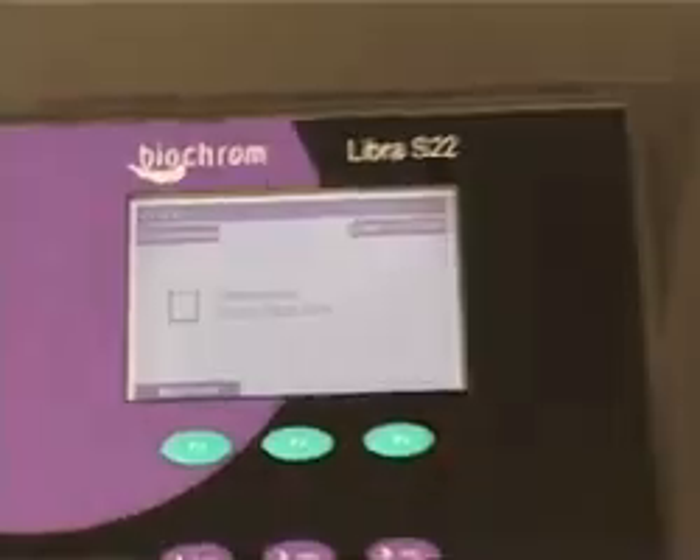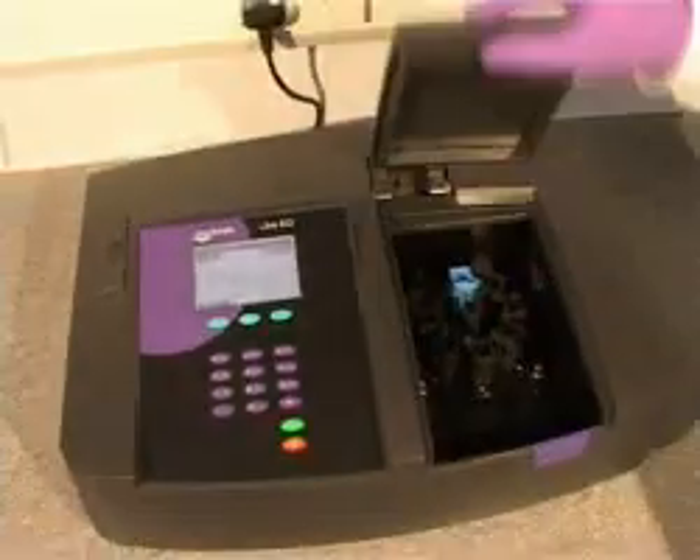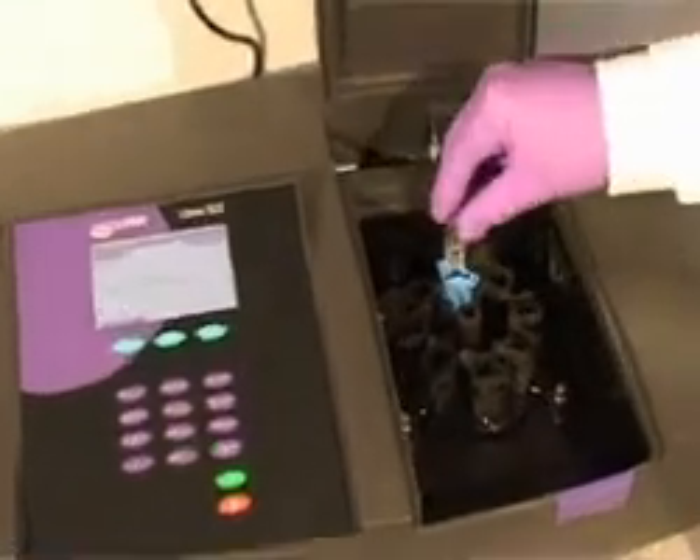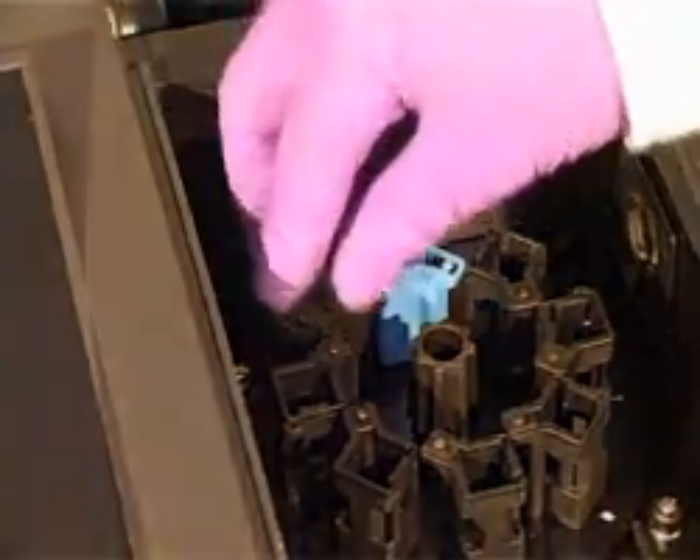The Libra S22 is supplied as standard with an 8-cell changer. Other accessories are available, including thermostating options, long path length cell holders, and a sipper unit.